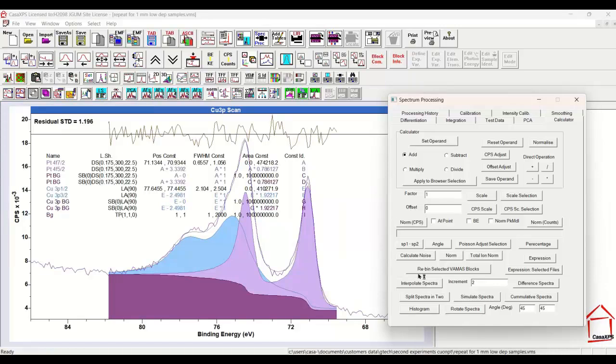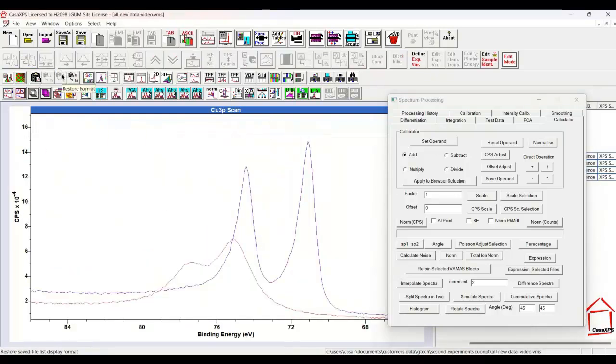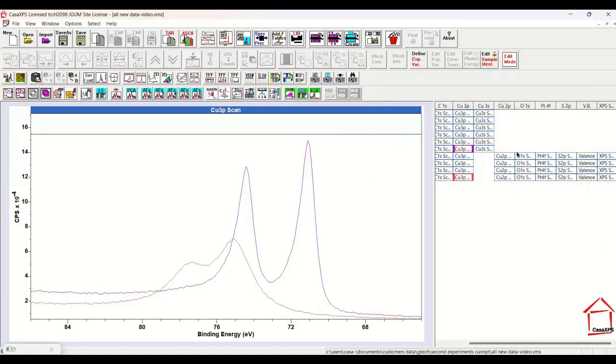While the calculator allows us to interpolate spectra and generate different proportions of platinum and copper, there's no substitute for data itself. And in this example I'm going to use a different measurement from a different file. So these are measurements that were performed using the same instrument and on different samples, and we have two for which there is predominantly platinum and predominantly copper. So from this I can now construct a set of spectra that are a reasonable test.